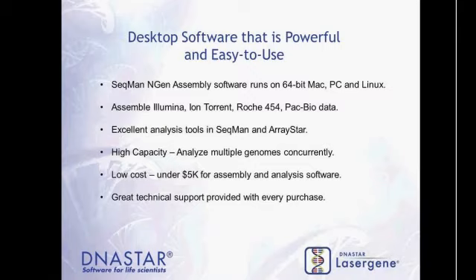And that's very nice for desktop computing. A lot of times folks using other software will have to resort to things like Linux clusters, very expensive computers. Our software is designed to run on computers that can be under $5,000 or in some cases under $3,000. And of course, we provide great technical support with every purchase.